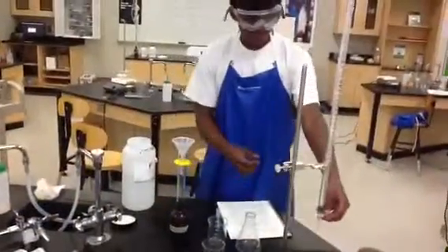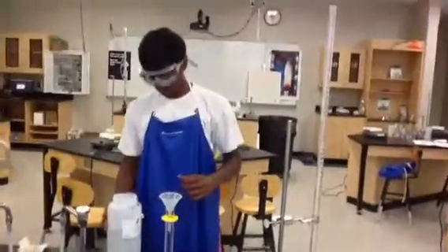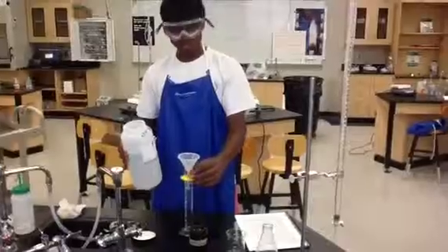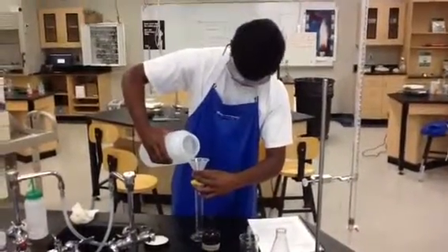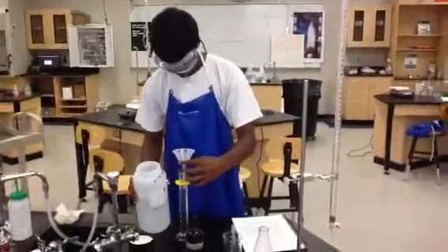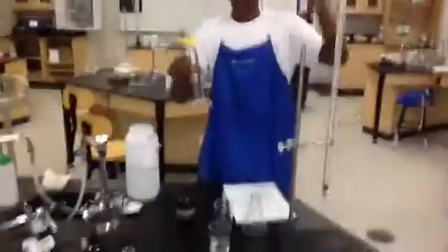So after you close the burette, you should fill it up with a base. So here I'm going to add the NaOH to the graduated cylinder and then to the funnel. Then I'm just going to pour it in, using the funnel again.